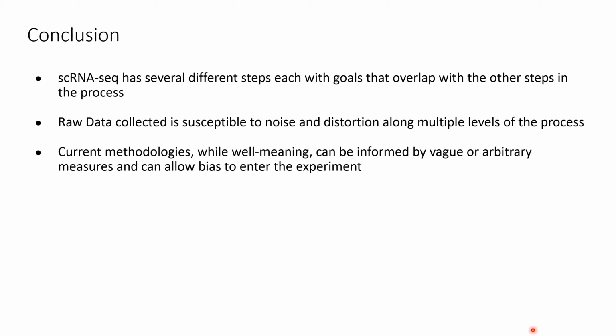But current methodologies, while well-meaning in approaching specific challenges, can be informed by vague, arbitrary, or historical concepts and allow bias to enter the experiment. So generally, I recommend using models that have the least strong assumptions in the analysis procedure and that seem reasonable to you and other people you know who may have more expertise in the area.